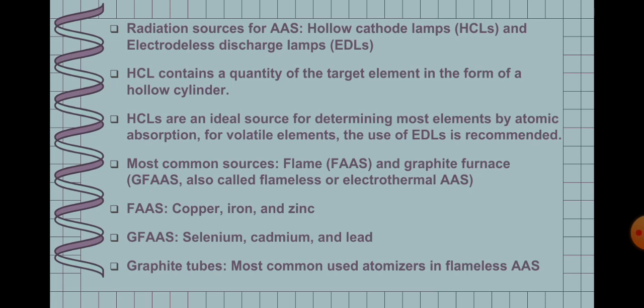Copper, iron, and zinc are often measured by FAAS or flame AAS, whereas in GFAAS, they measure selenium, cadmium, and lead.